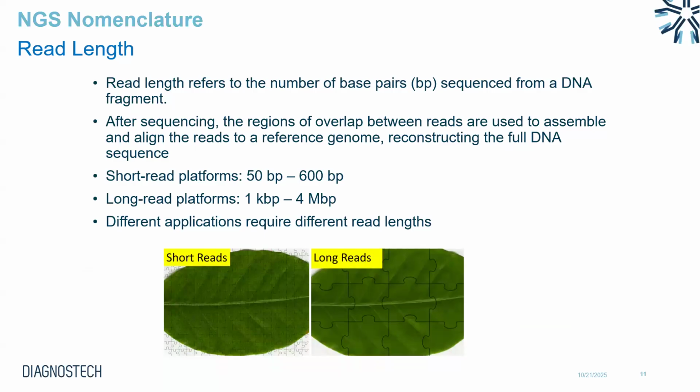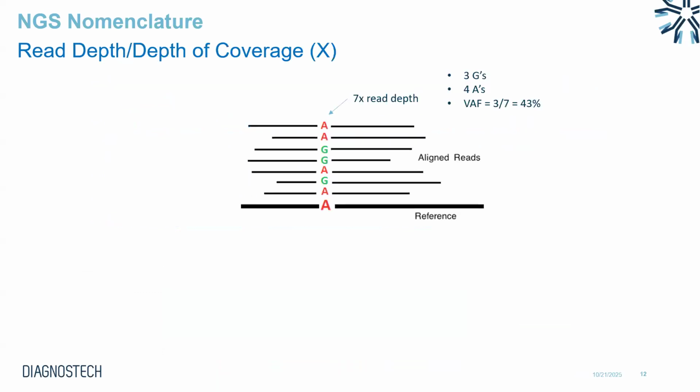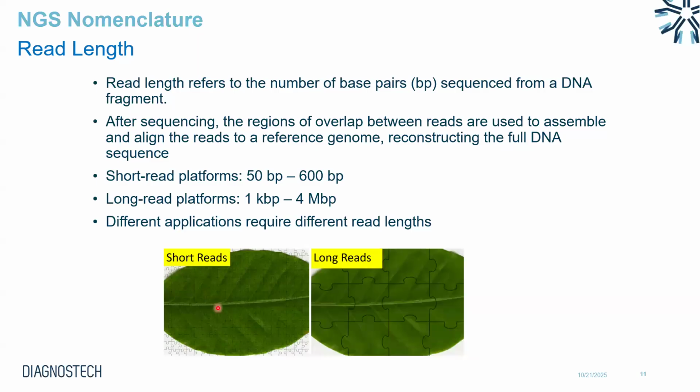It's just a little infographic to show the difference between short reads and long reads. So yeah, you need to piece together many more pieces with short reads, whereas with long reads, because they're longer, there's obviously fewer pieces you need to piece together.